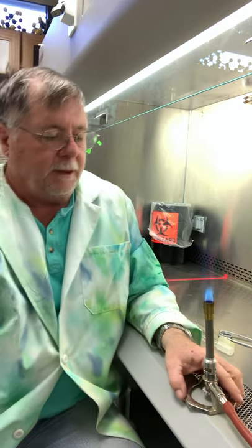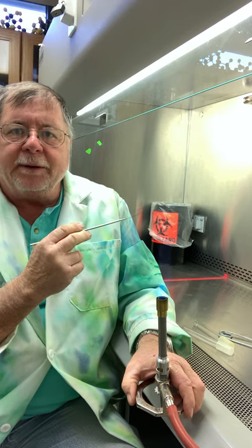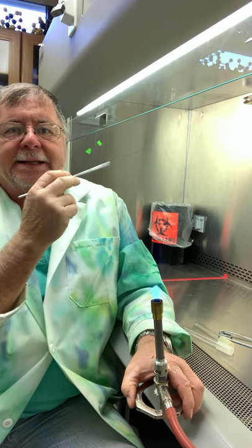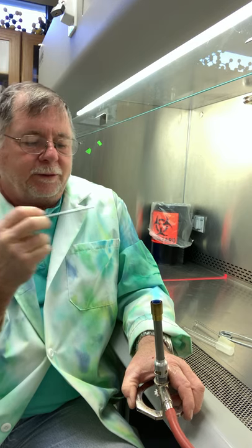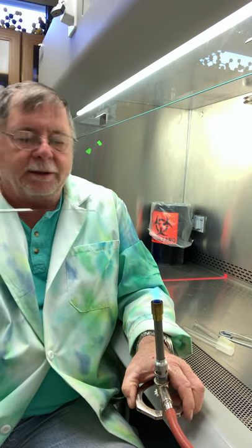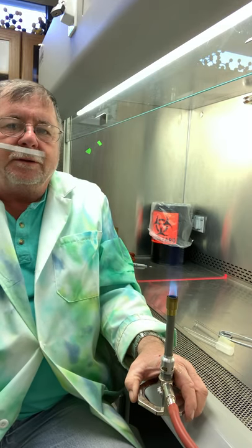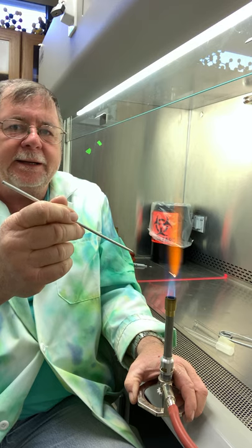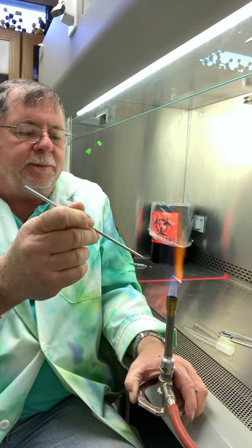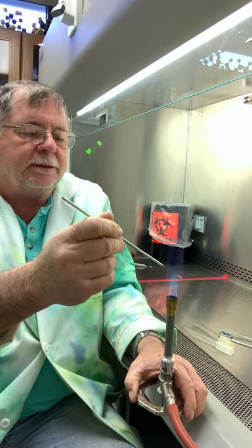So I'm going to hold this out here because in our biosafety cabinet, we have a plastic lining that will get too hot if we just put our burner in there. All right, so we take our loop and put it at the tip of the blue flame, right like that, and then we heat it. We move it forward across and sequentially get it red hot.